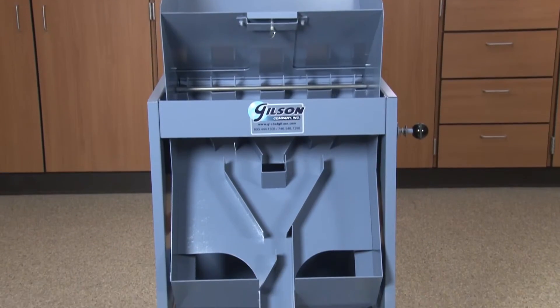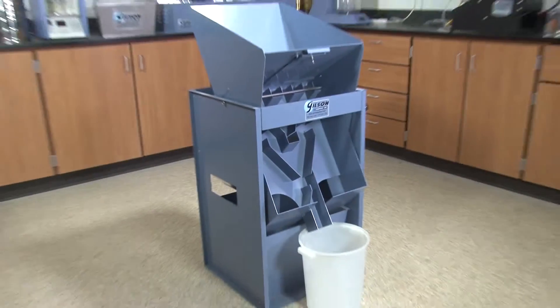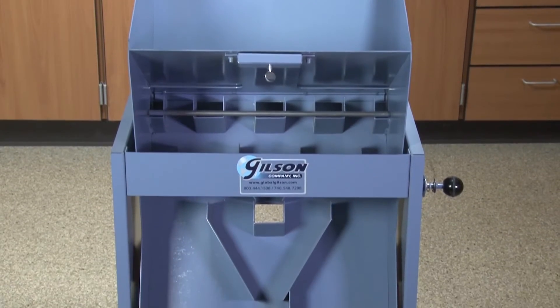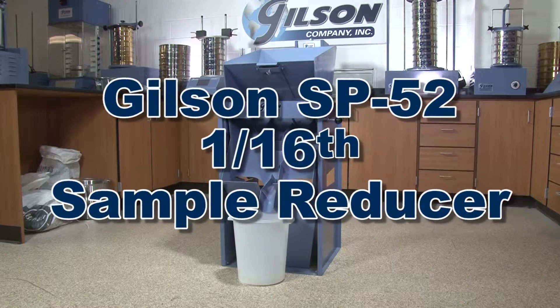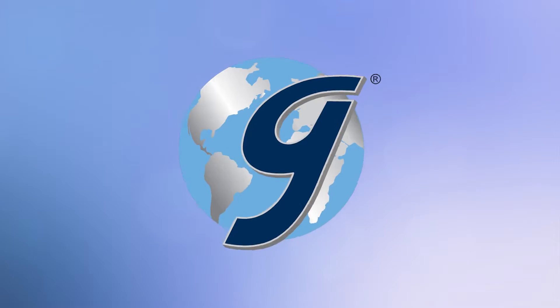A sturdy steel pan is included to collect the waste fraction, and the divided specimen can be collected in the optional SC20 polyethylene sample container. This rugged steel constructed unit stands up to field conditions and is the optimal height for ergonomic loading and operation, making the GILSON SP52-116th Sample Reducer the right choice for your material testing lab.